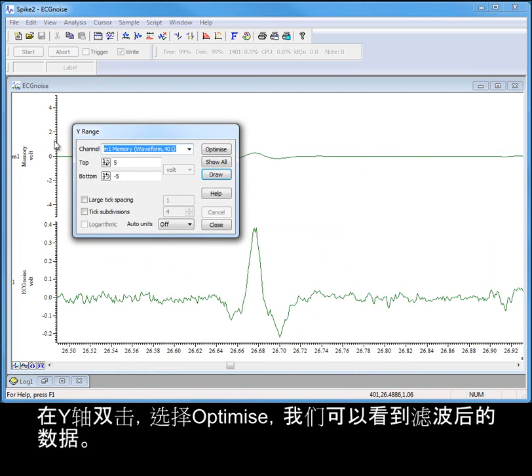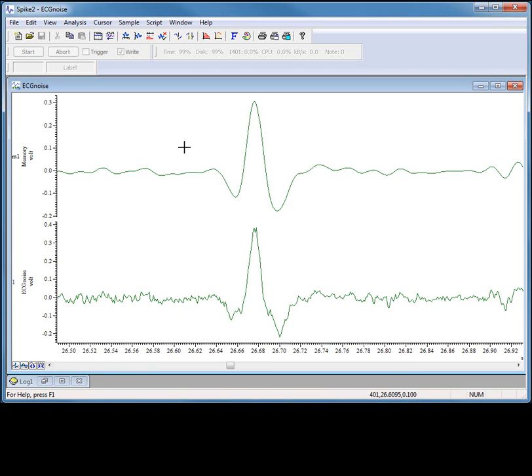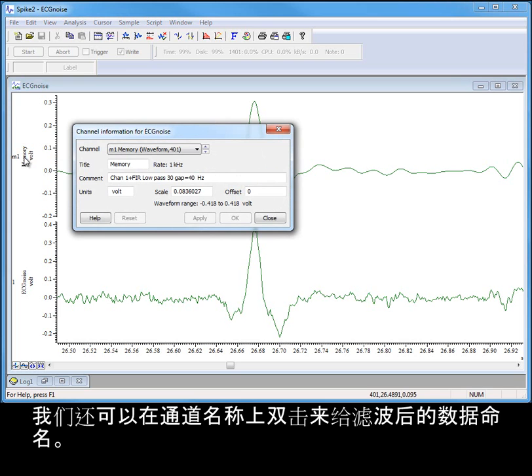Double clicking on the y-axis and selecting optimize shows us our filtered data. We can also give our filtered data a title by double clicking on the channel name.